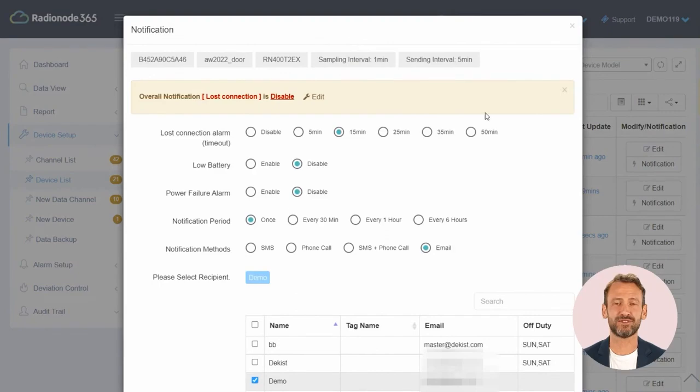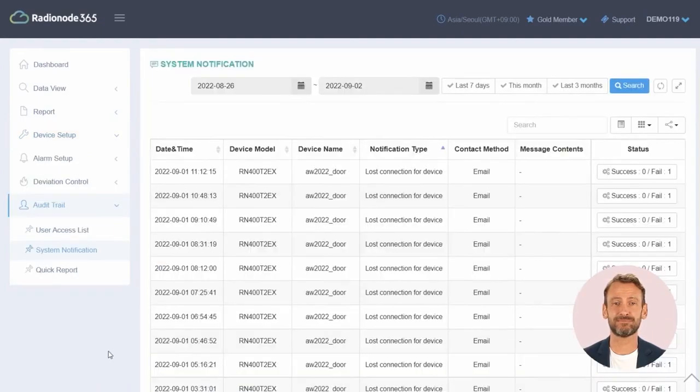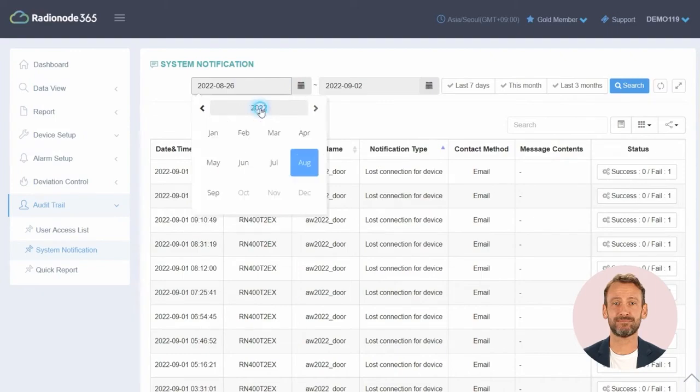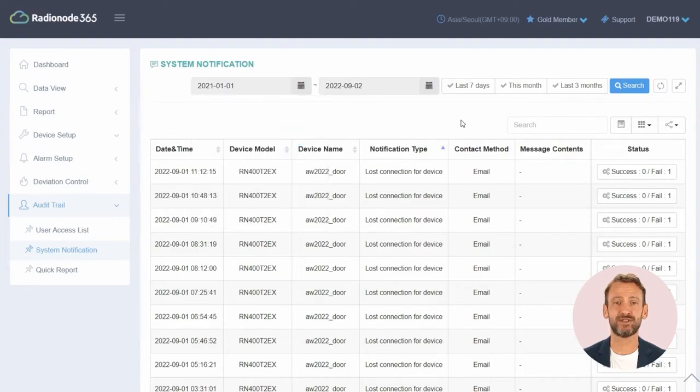Third, for products with a built-in UPS, there is power notification, which notifies the user when the DC power of the product is lost, changing the power supply method to the battery. This power change notification is widely used to manage power outages.